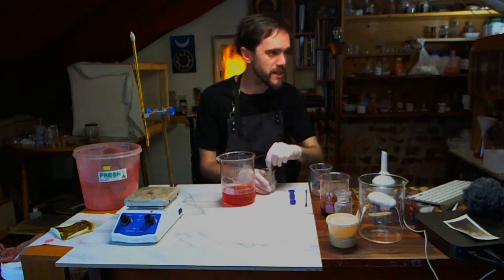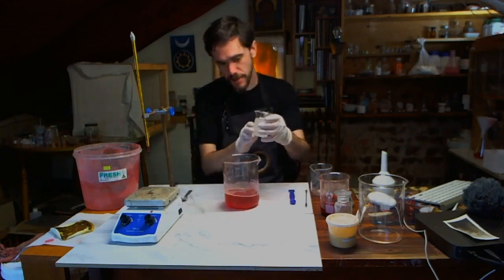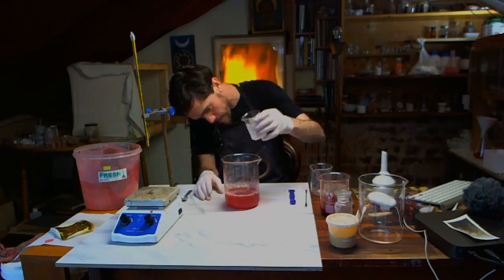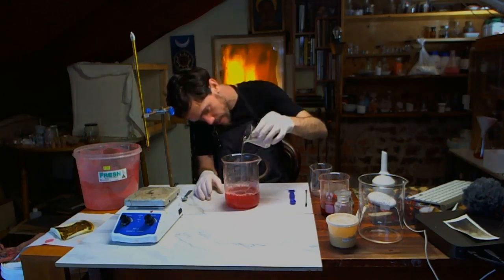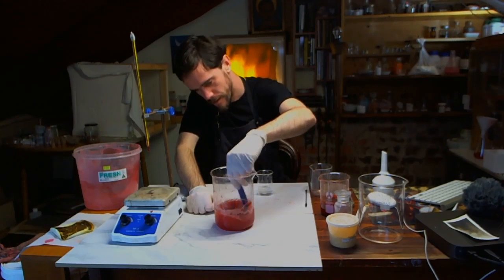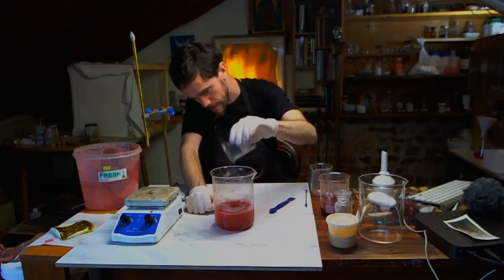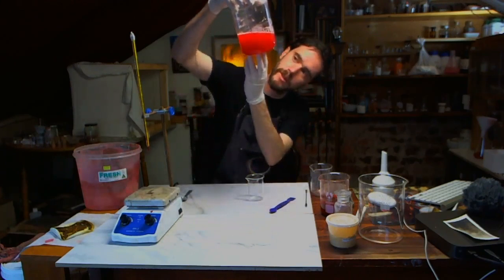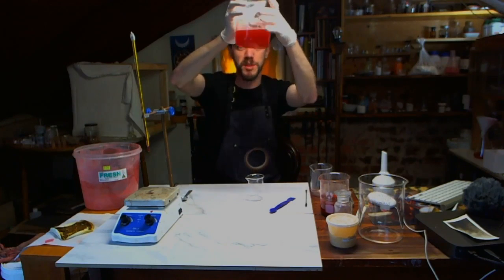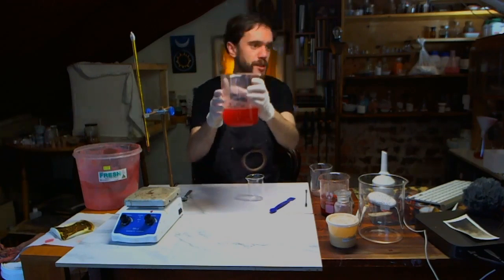I'll get to the Vivinite question in just a moment, but I'll just keep working on this. So again, let's see if the two hot solutions makes a difference to the foaming. So you can see there, almost no pigment precipitating out as we add all of that in. So despite its red color, there doesn't actually appear to be much more pigment to precipitate out there. There's a bit. There's definitely a little bit, but not that much.